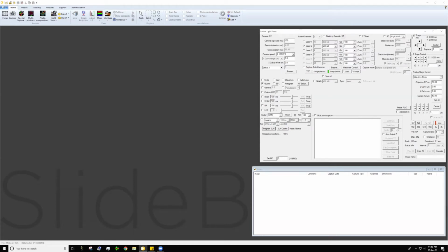Step 12. This is where you select the ROI if you are outside of the presets. Step 13. Tick time lapse, input the number of time points and select an appropriate time interval. 0 corresponds to running as quick as possible. Step 14. Finally, program SLM to ensure all the settings are synced.